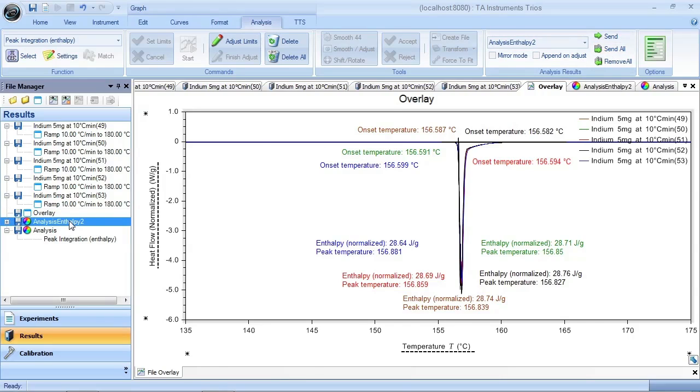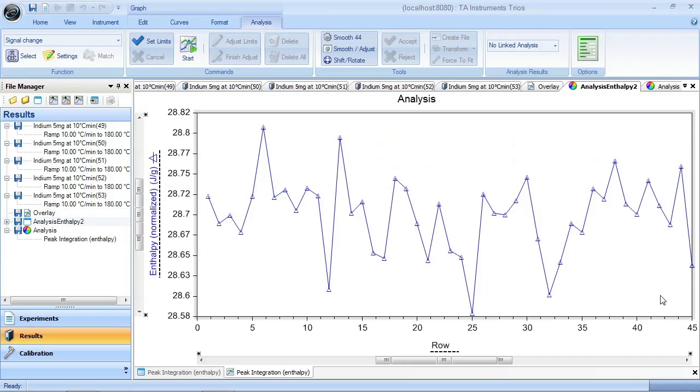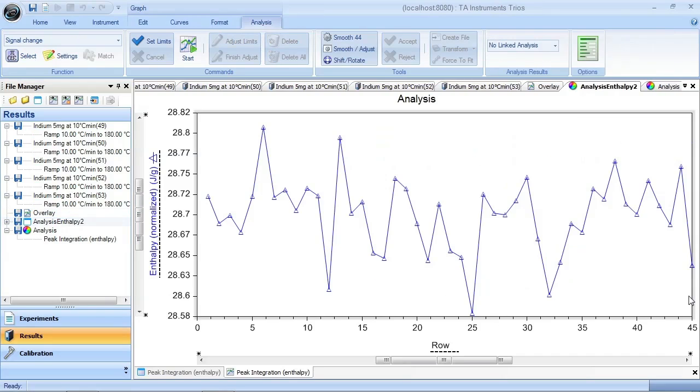Now I go back to my report and now I've got 45 runs. So every time I do another set of indium verification runs, I can just keep adding them to this report, and I can keep this going on. Now I just save this.